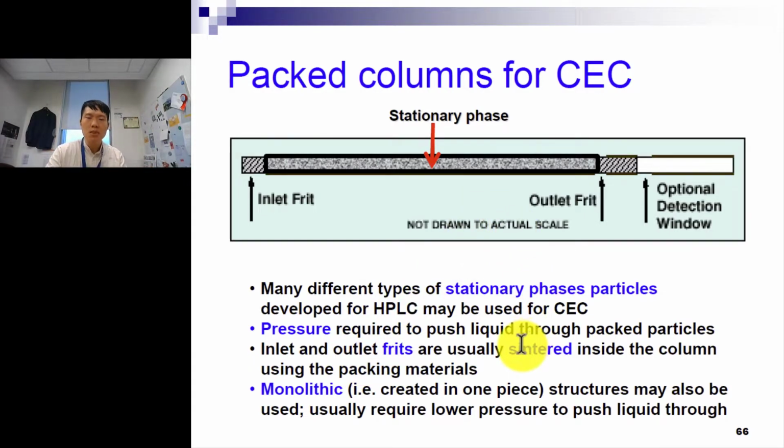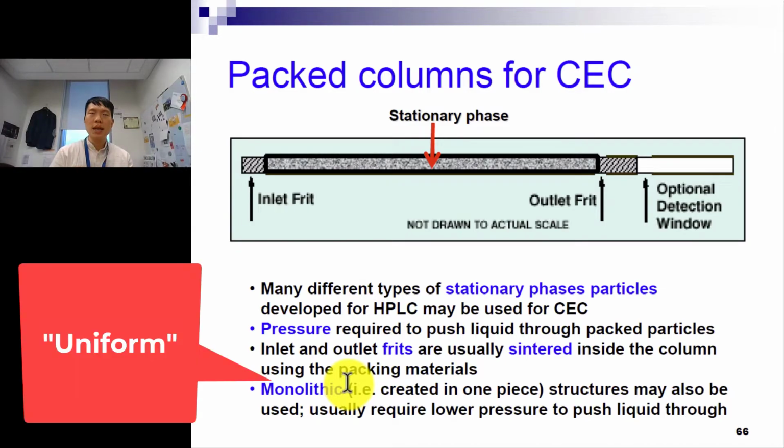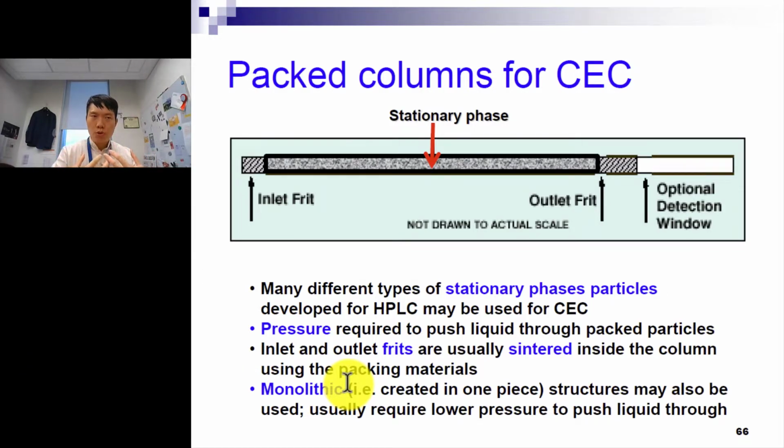Okay, and the term sintered means that there are just many holes, and normally we refer to some silicon oxides. Okay, there's some cavity. Make sure there are some kind of tunnels and channels for some liquid to go through here. Now for monolithic, this term is more of a materials chemistry. It just means that it's created in one piece, which means it's not like I take different parts and glue them together. So it's really created uniformly, okay, through one kind of reaction.